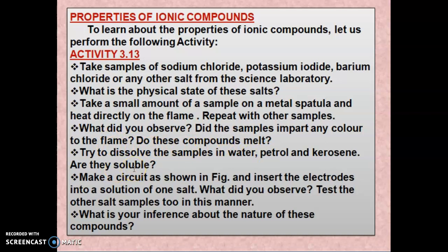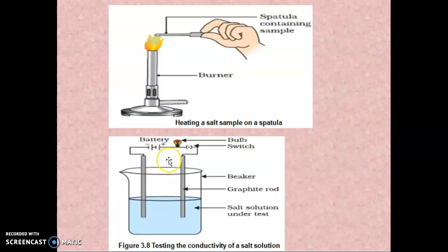Are they soluble? Next, make a circuit as shown in the figure. You have to test the conductivity of a salt solution. Here we are taking a graphite rod, and that rod will be dipped inside the salt solution under test. The salt will be dissolved in water or any other solvent. Now you have to check whether that salt solution will conduct electricity or not.